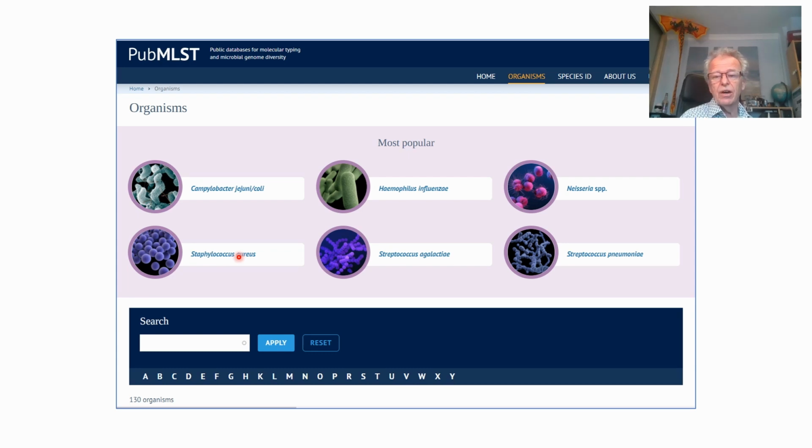Keith Jolley at Oxford is the boss over all of us, and the actual software is done at Oxford. So we all benefit from the updates of any software that are done at the University of Oxford. I'm purely the curator for Cronobacter, but I think this video may well be of use to people with similar interests with different organisms.